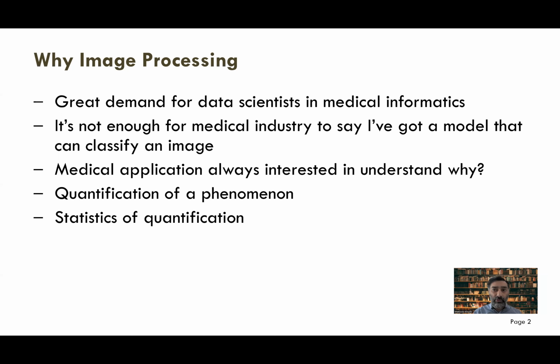For example, say you are employed in a medical setting, at a pharmaceutical company or a research institute, investigating the efficacy of a drug on certain types of cell lines or cancer lines.